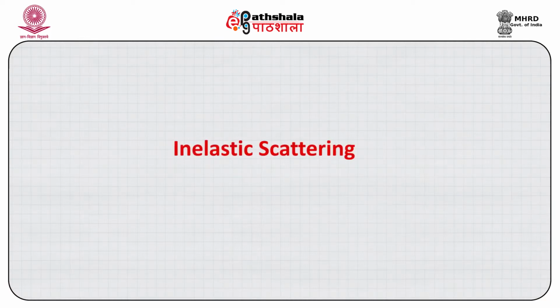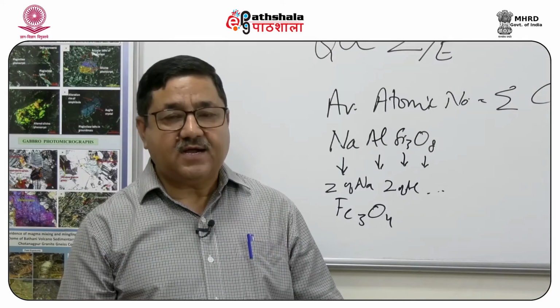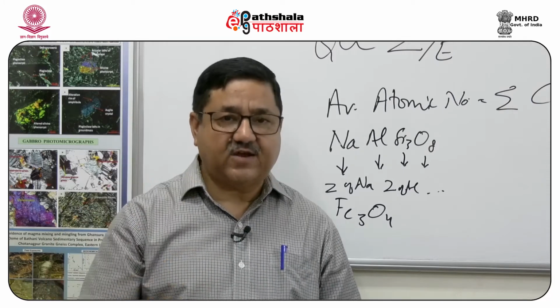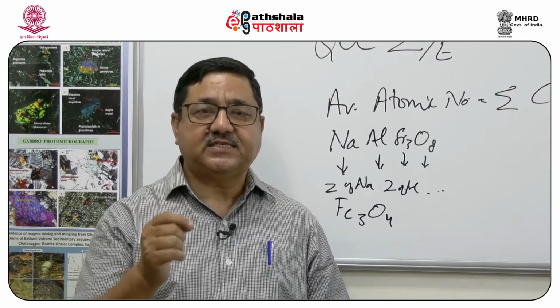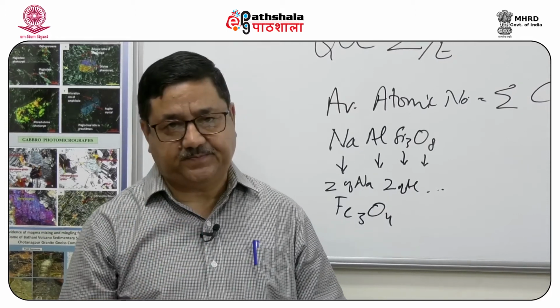Now, inelastic scattering occurs because an incident electron beam passes through several events till such time it loses all its energy.